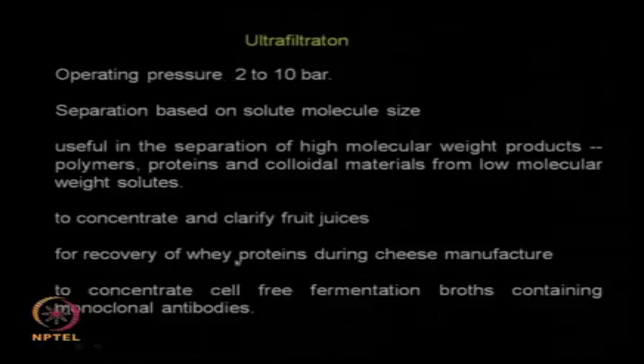We can use it for recovery of whey proteins when you are manufacturing cheese. We can use it for concentrating cell free fermentation broths containing monoclonal antibodies. So that means I want to remove whatever cells are still left behind during my conventional filtration or during my microfiltration, then I can go to ultrafiltration.